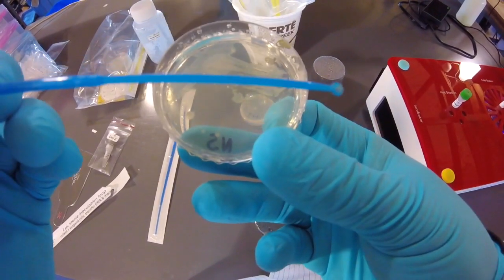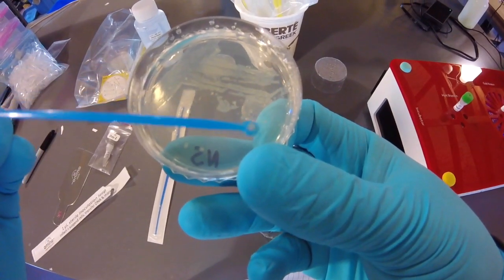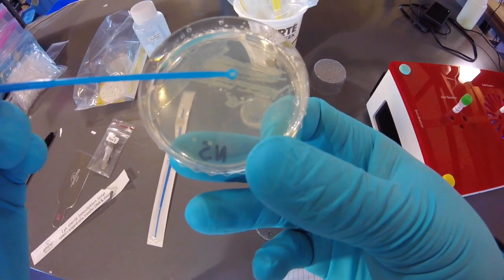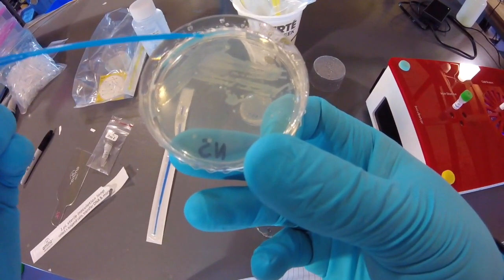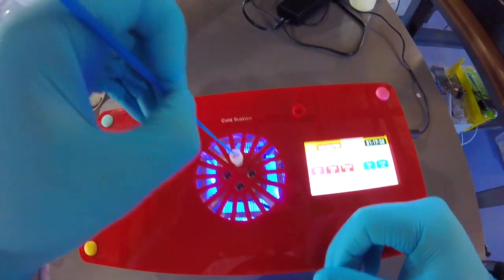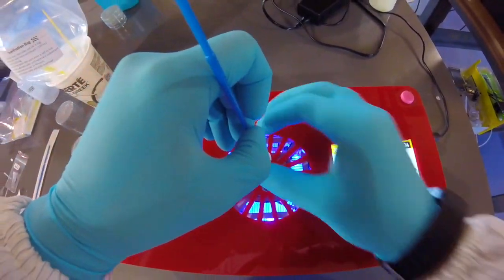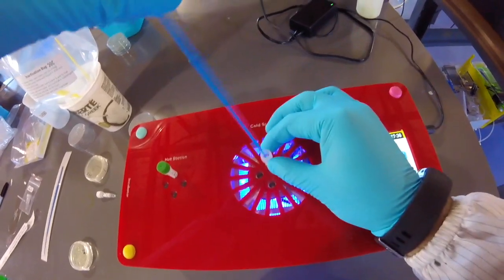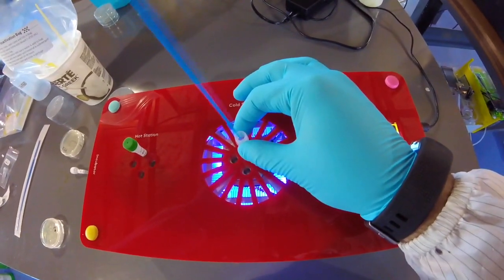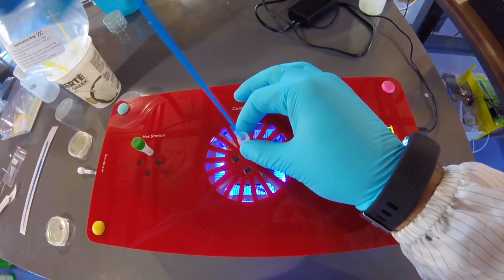It's wet, so you can see that now the center is kind of full of cells, almost. I'm just going to collect one more colony here. Alright, so that's pretty much full, so that should be good. And now I'm going to go back and put this in so that it gets to the bottom of the tube. And then I'm going to spin the loop here, and that's going to dislodge the cells from the loop, and it's going to mix them in.